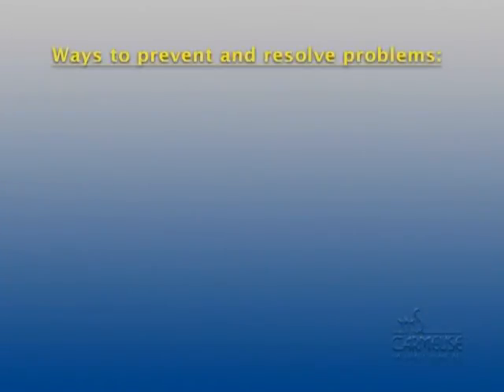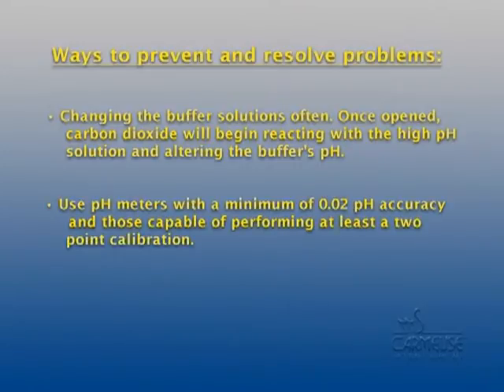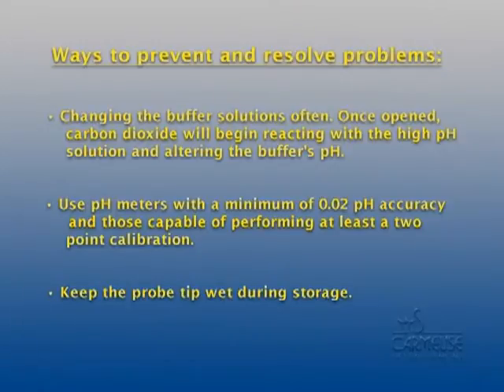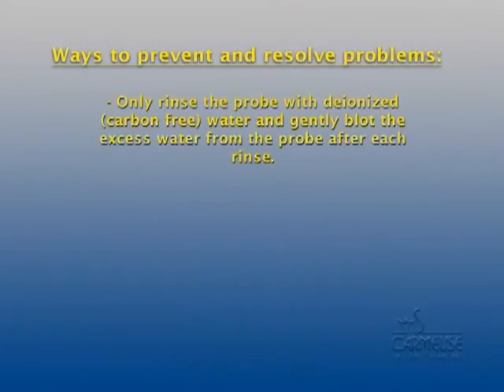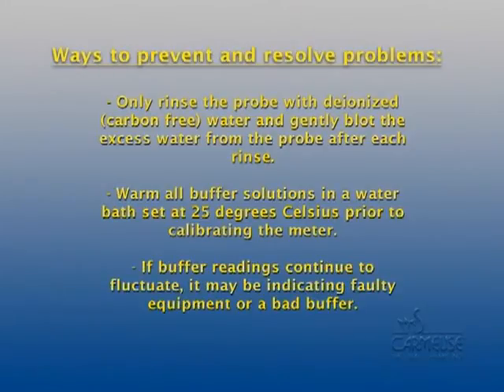By routinely performing this test method, Carmoose has recognized several common situations which can cause faulty test results. Change the buffer solutions often — once open, carbon dioxide will begin reacting with the high pH solution and alter the buffer's pH. Use a pH meter with a minimum of 0.02 pH accuracy and one capable of performing at least a two-point calibration. Keep the probe tip wet during storage, and only rinse the probe with deionized, carbon-free water, gently blotting the excess water after each rinse. Warm all buffer solutions in a water bath set at 25 degrees Celsius prior to calibrating the meter. If buffer readings continue to fluctuate, it may be indicating faulty equipment or a bad buffer.